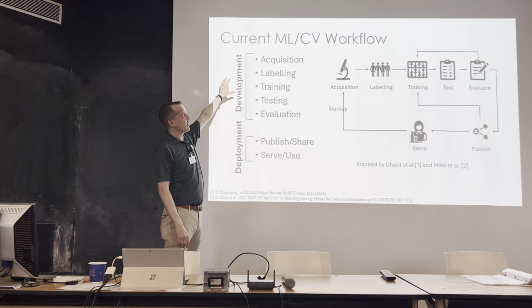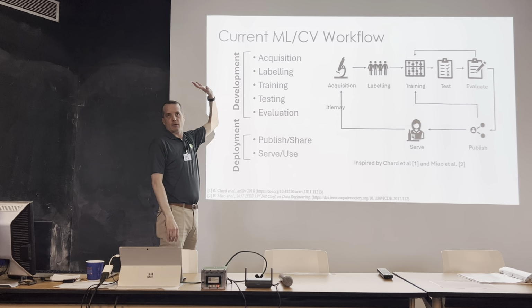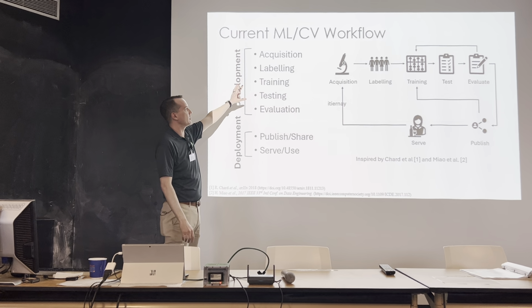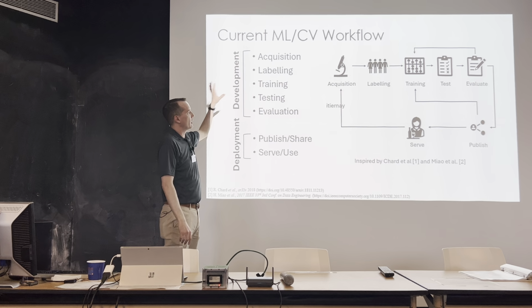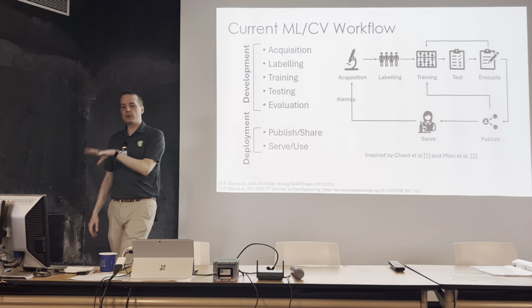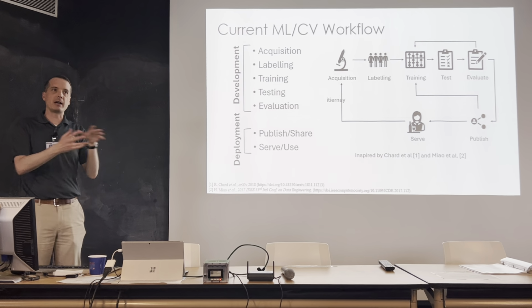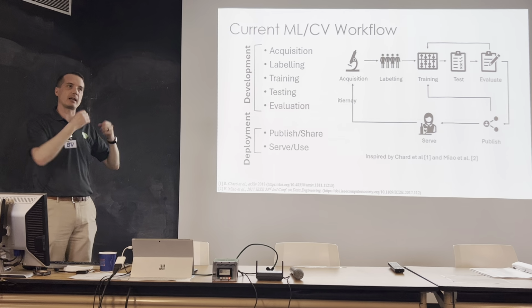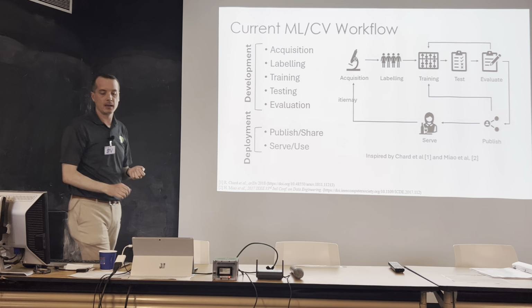So people are creating new models all the time. I'm sure 3 of them were created and published in the 30 minutes I've been talking so far. So the question though is, what about deployment? How do I get it so that a microscopist can use this model that someone else has created? Because microscopists don't want to create the models, they just want to use the models, annotate their data for them, and move on and get their answers.